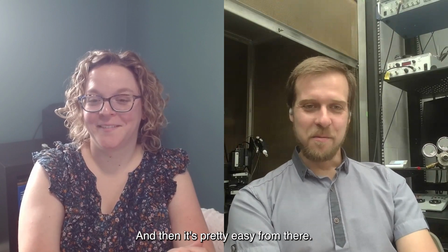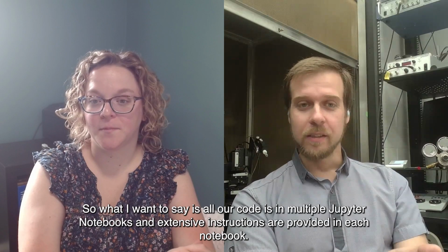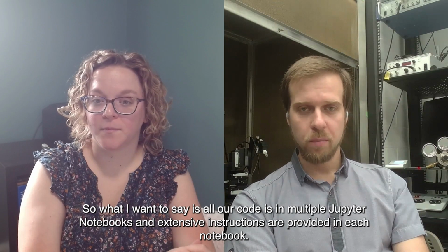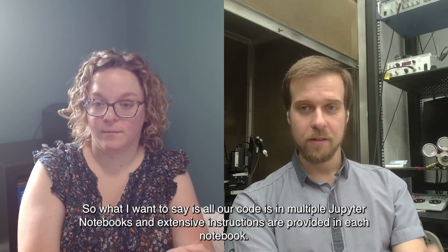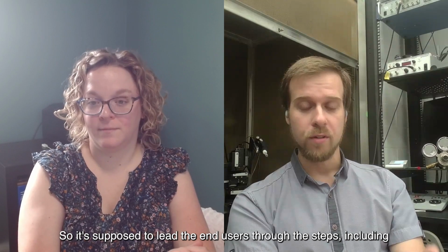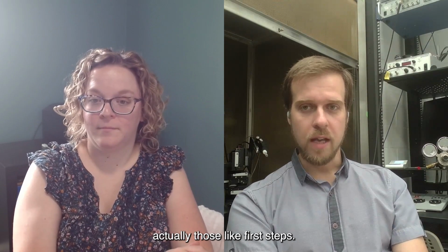All our code is in multiple Jupyter notebooks, and extensive instructions are provided in each notebook. It's supposed to lead the end users through the steps, including those first steps.